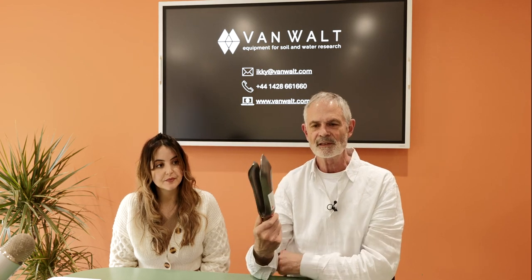Next one I want to show you is an auger for what we call stony soils. Let's see, how can I get the image? You can see, if I hold it like that, you've got these pointy bits, and the theory behind this is that if you hit a stone, you use one of these, and if you are lucky, these tips will push the stone aside so you can continue with your sampling. Not a tool that you want to use for general sampling, because it's actually quite difficult to empty and it disturbs the sample quite a lot.